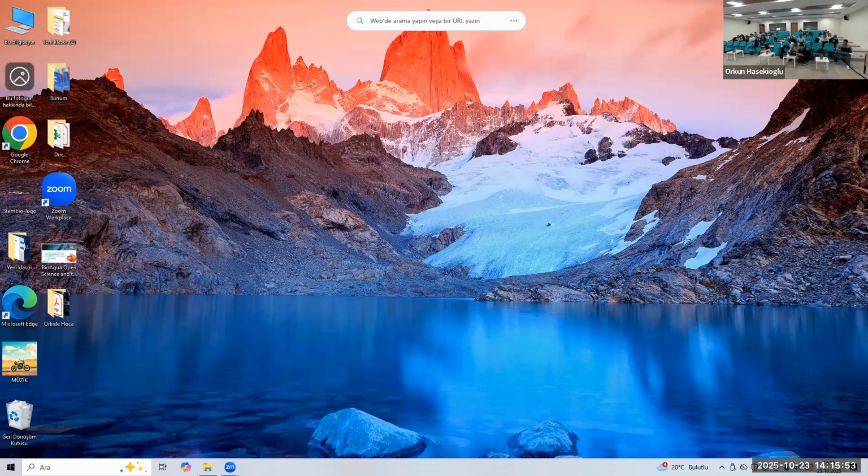Now I want you to go to Chimera again. You can close this VMD. Let's close everything. Everything has to be in the same folder, don't forget that.